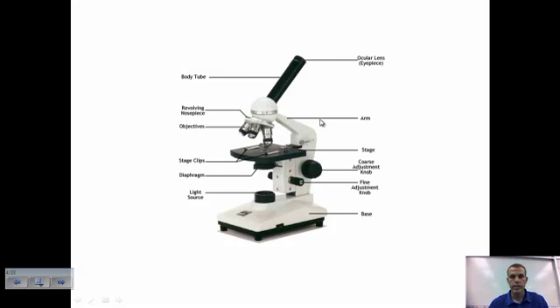You can see the arm here for carrying purposes, your stage where you set your slide on. Your stage will move up and down when focusing. Here's your stage clips that hold your slide in place. You have your diaphragm here. There are two different types: an iris or a disc. This particular one is an iris, so it closes like your eye, opening and closing, allowing a certain amount of light to come in. There's also a disc one that can spin with smaller to larger openings that allow a certain amount of light to come in.